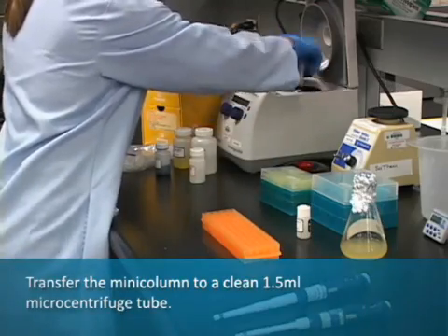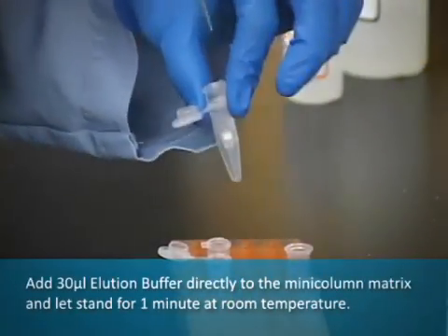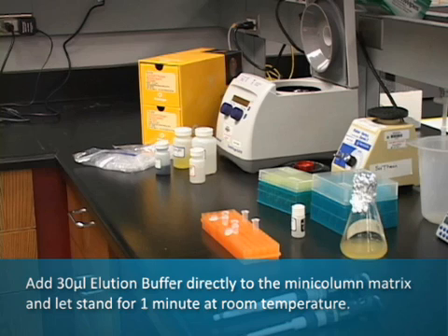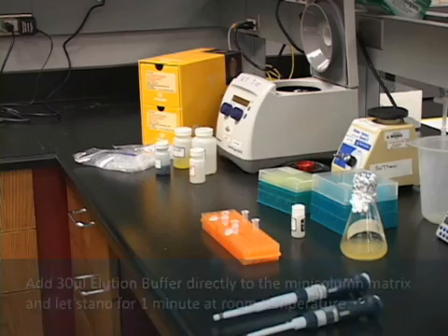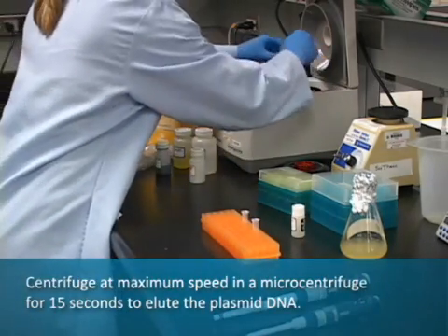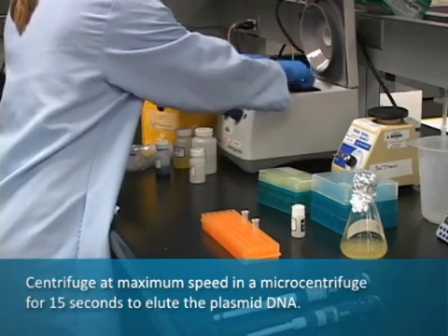Transfer the mini column to a clean 1.5 milliliter microcentrifuge tube and add 30 microliters of elution buffer directly to the mini column matrix. Let it stand for 1 minute at room temperature. Centrifuge at maximum speed in a microcentrifuge for 15 seconds to elute the plasmid DNA.